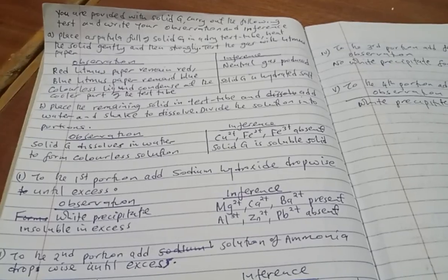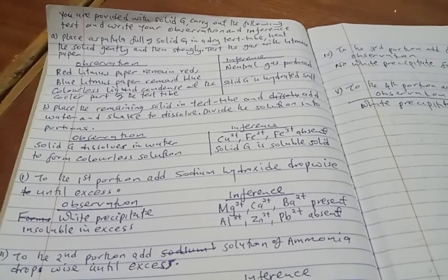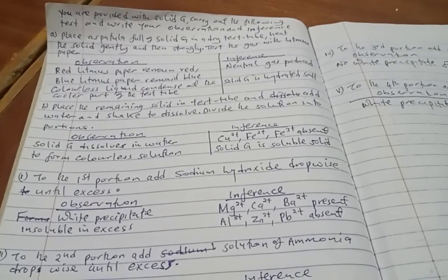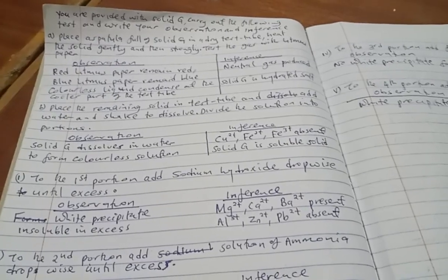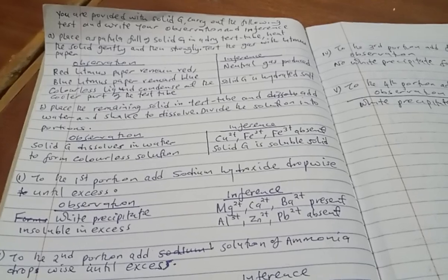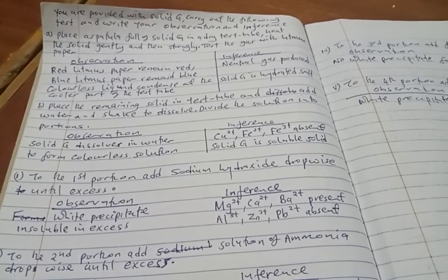If you continue heating strongly, then a colorless liquid condenses at the cooler part of the test tube, or whichever tube you are using. Then you tell us under inference that solid G is a hydrated salt, or you say solid G contains water of crystallization. So when we are heating gently, we are testing the gas. When we are heating strongly, we are testing the hydration of the salt.